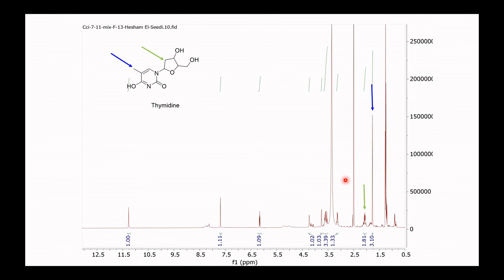at 1.7. Another CH2 is directly attached to the oxygen. Then it is more chemical shift at 3.5, right? And the next one is even more deshielded. Why? Because it is ring size effect. It is inside the ring. Then it is more deshielded. So you see every small factor affecting in the proton NMR.